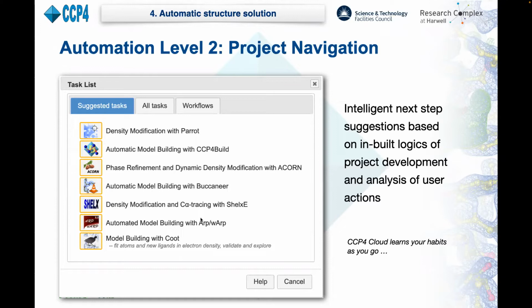So it is kind of a problem if you want to help users to navigate in such a huge and complex system as CCP4. So instead of just pre-coding something, CCP4 Cloud includes a learning facility with basic inbuilt knowledge base, which can analyze completed structure solution projects and suggest follow-up tasks on that basis. I think this is something new in the area, isn't it?